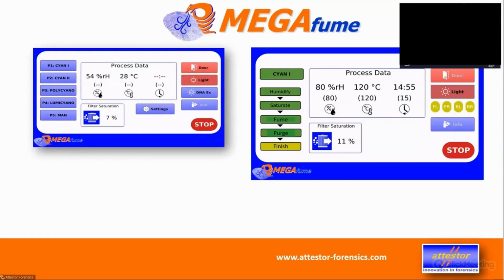Now, that's also something new that was not present with the cabinets when we started the development. Probably meanwhile it is. We have a so-called storage or preservation mode, we call that.